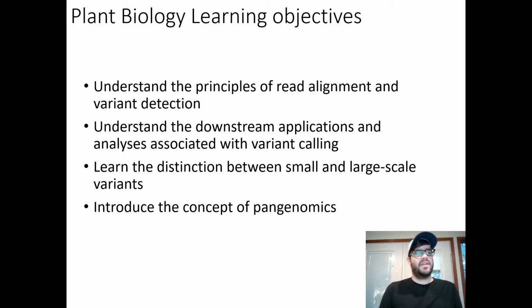And then at the very end, we'll introduce the concept of pangenomics and some of the applications that we can have with that. And so again, we're going to skim the surface here, but if you're interested, there are a lot more in-depth lessons or entire courses that you could take on any one of these topics.